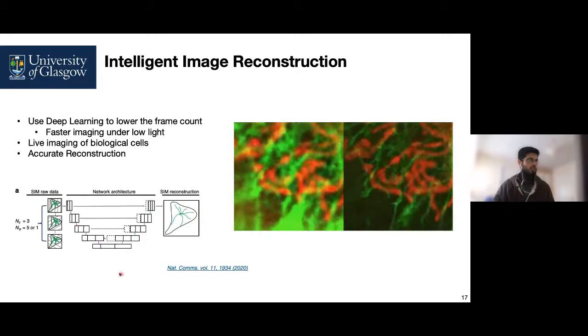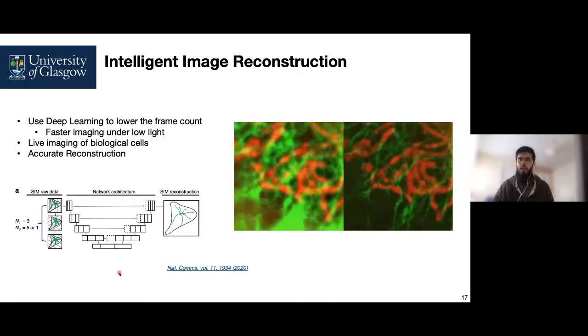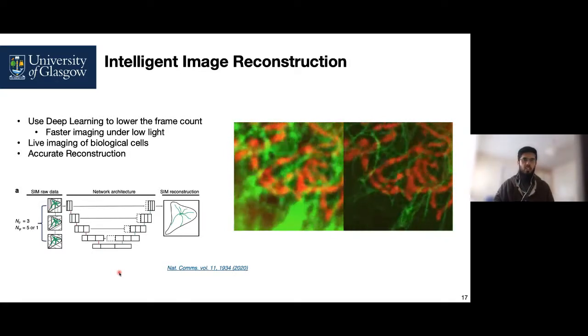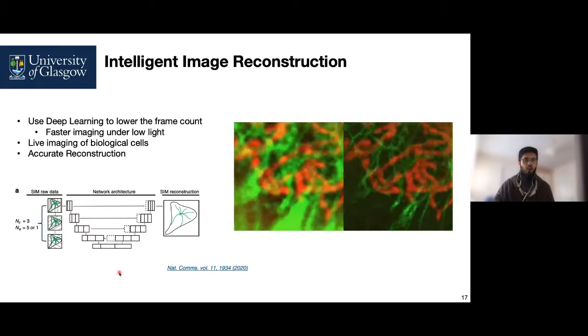So this is a very recent paper in which the authors proposed, just like in conventional machine learning, where you have a training data set, and based on that training data set you train your classification model, and then apply that model on different images or for any classification purposes.